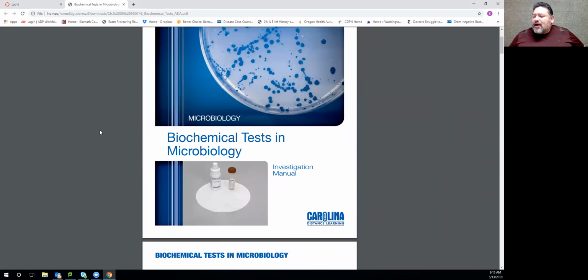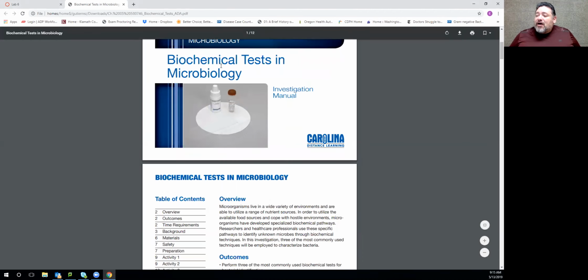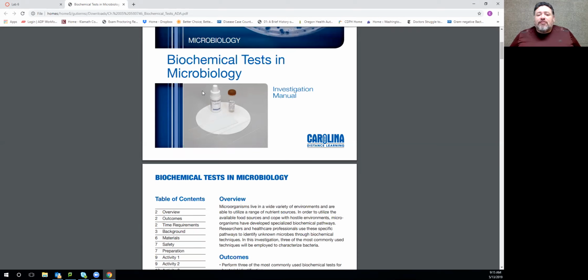Okay, I asked you guys to please read the materials, and I'm going to start with the biochemical tests of microbiology. Okay, overview. Why would you do this? A lot of things that you're doing right now has to do with identification of a microorganism. So when we studied staining, it was to identify a microorganism. Now we're going to use biochemical tests in order to identify a microorganism.